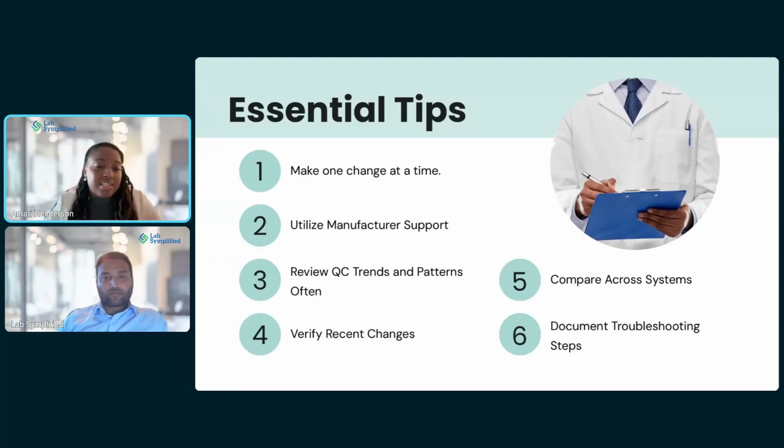So I think that's one of the number one tips. Just change one thing at a time so that you can keep track of your troubleshooting process and it's orderly and it makes sense.